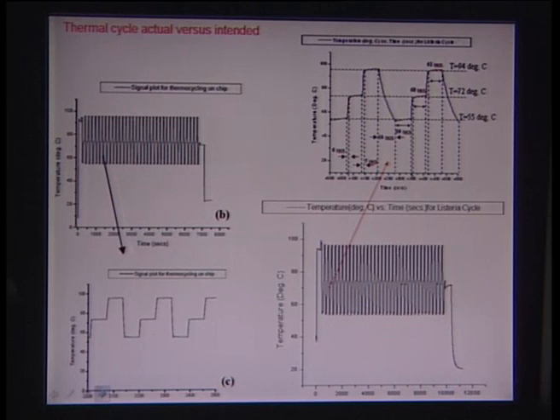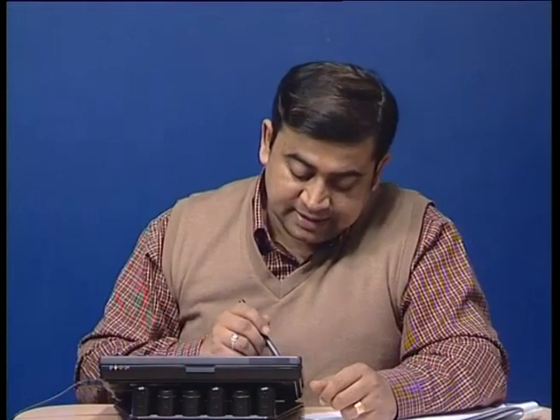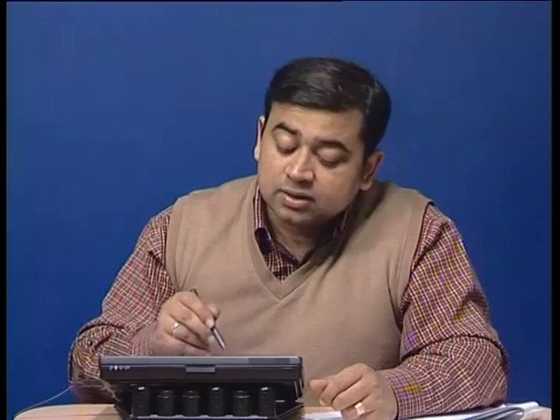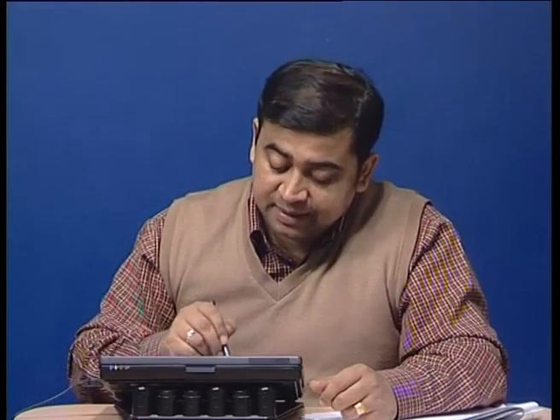Let us talk a little bit about thermal cycling. A very interesting issue here is the time of the PCR reaction. As we have to rapidly thermally oscillate a certain fluid volume, there is almost always an issue related to thermal management or heat transfer across the fluid, and some of these snapshots here, taken from real time signals on microchip PCRs, show how these thermal cyclings can be rapidly varied.